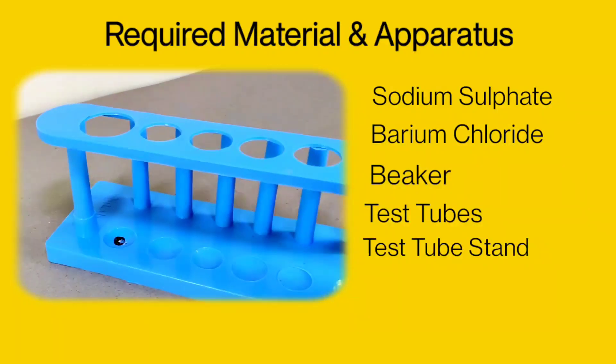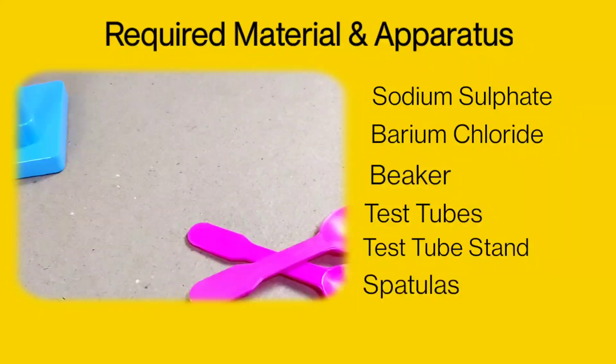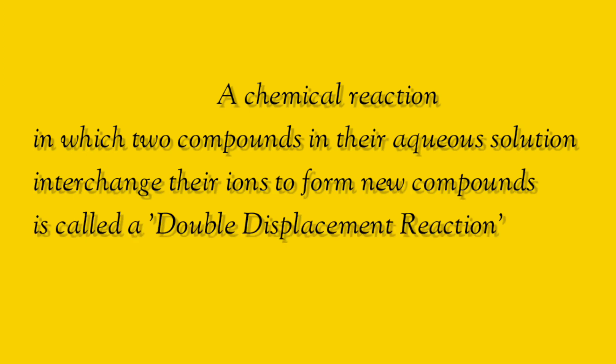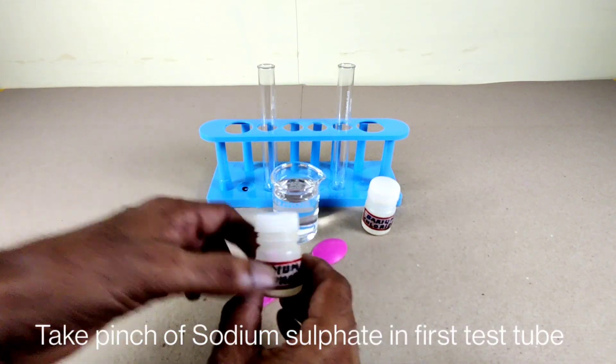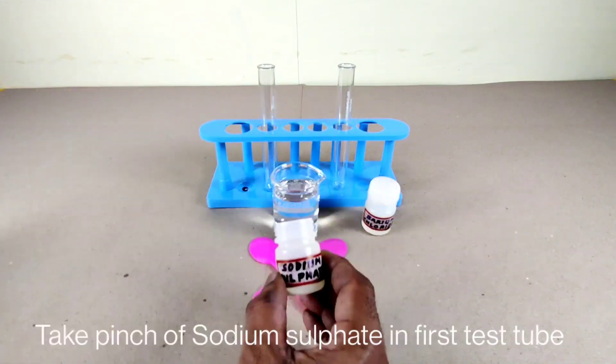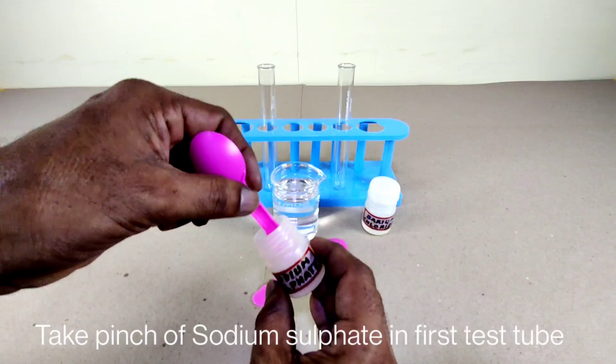A chemical reaction in which two compounds in their aqueous solution interchange their ions to form new compounds is called a double displacement reaction. Take a pinch of sodium sulfate in the first test tube.